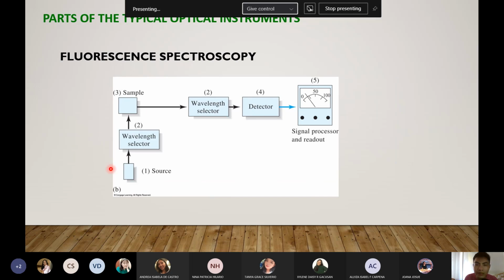Kailangan naka perpendicular. Okay? So, ang gagawin kasi nito is, remember, fluorescence ito. When you pass through an incident wavelength dito, mag-glow yan. So, for you to accurately measure gano'n siya nag-glow, kailangan naka-perpendicular ito. Para hindi dumagdag yung color nito, hindi dumagdag yung light nito. So that yung detector, ang malalaman lang niya is kung gaano karami ito nag-glow. Kasi kung imagine mo, andito yan, imagine mo kung andito siya.